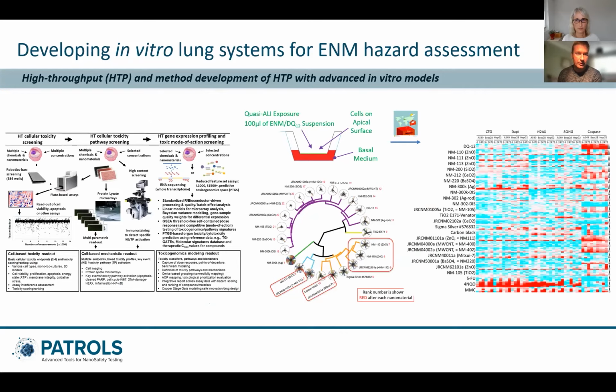Moving forward with the global understanding of the predictive quality, or even the understanding of the toxicology of these nanomaterials with the short-term system, in collaboration with MISFIC, we've done a bit of work to deduce whether or not our advanced lung cell culture can be used inside of their technology, specifically their lysate microarray technology.